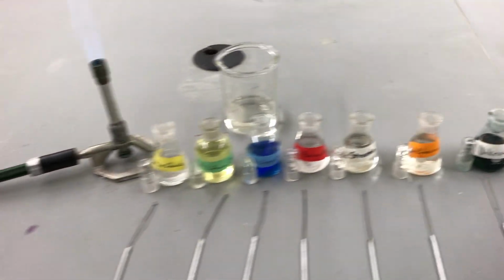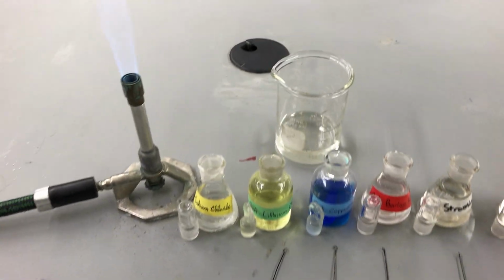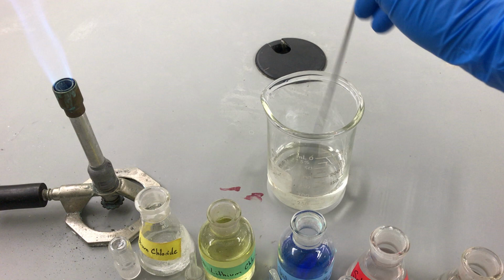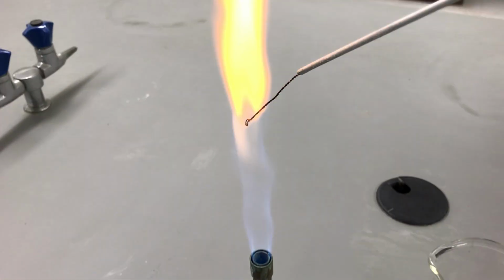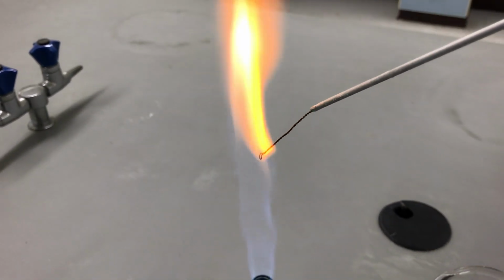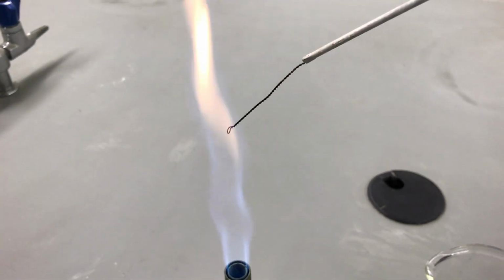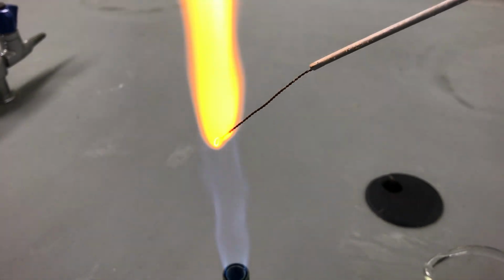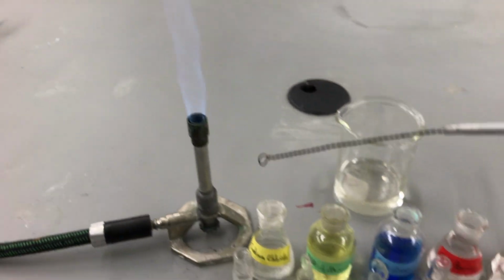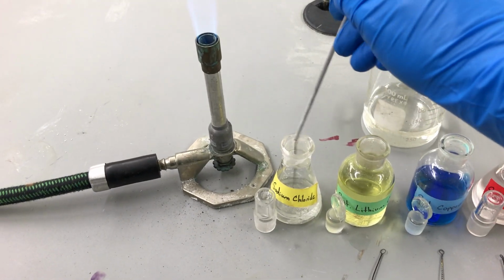So the first thing we want to know is, of course, we have already decontaminated all of our flaming loops. The flaming loops are decontaminated by dipping them in nitric acid like so, and then flaming them off. And when we flame them off, we want to get them really red hot. So if it's glowing, it is good, as you can see.